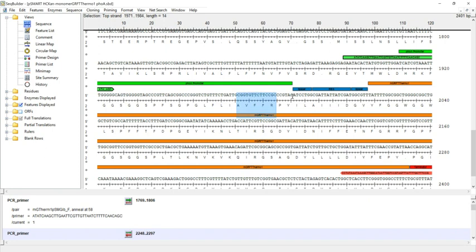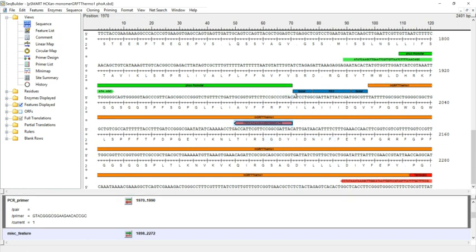For instance, if you are working with a plasmid and you create a bottom strand primer here and a top strand primer over here, you'll notice the arrows point in opposite directions. That means you amplify the whole sequence. And with mutagenesis and insertion, you can actually add an additional DNA sequence in between those two primers to allow for insertion of that DNA sequence within the larger schema of what you're working with. That makes modification of DNA rather simple in some respects.